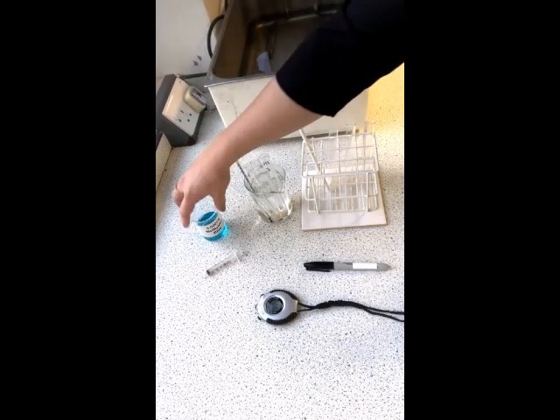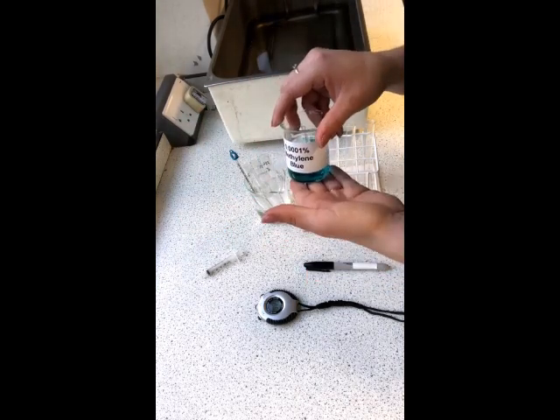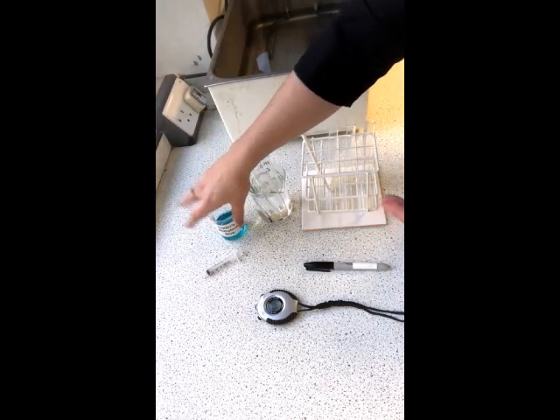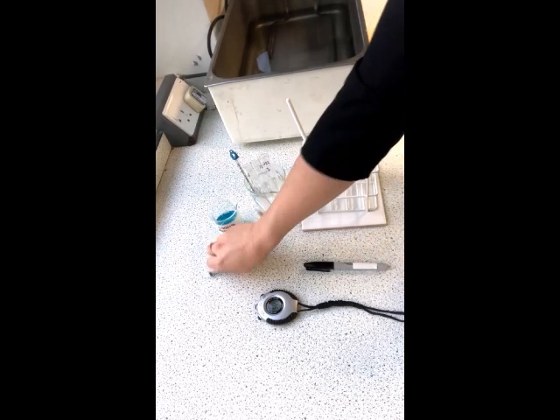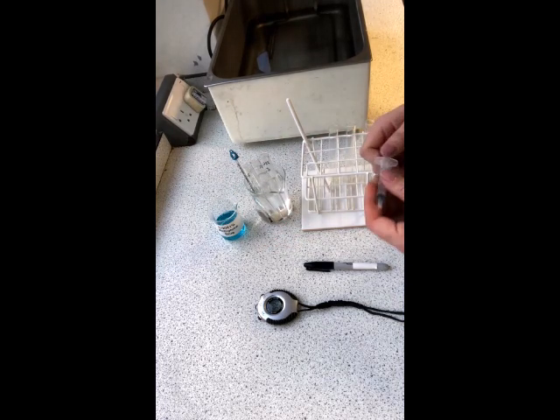So, things to remember about methylene blue. You should be wearing eye protection for this, okay? If you look up on the HAS cards about methylene blue, it's not something that you particularly want to get into your eyes. Okay, so what we are now going to do is use a fresh syringe for the methylene blue. We are going to measure out 2 centimeters cubed of methylene blue, and we are going to add these to our tubes with our yeast and our glucose mix in there.